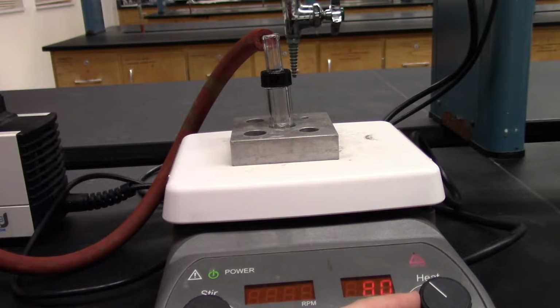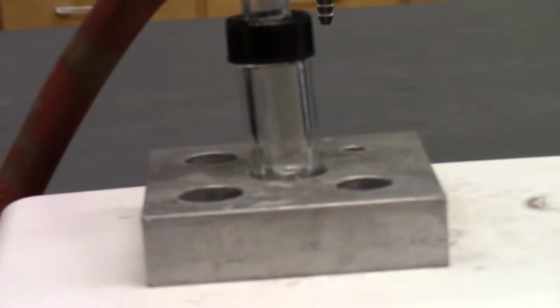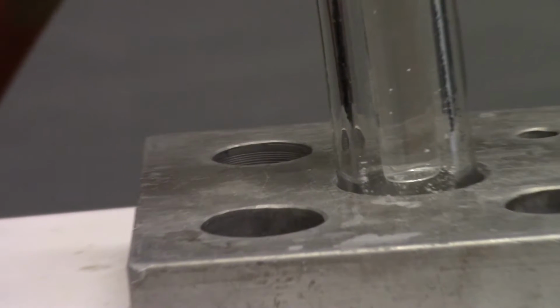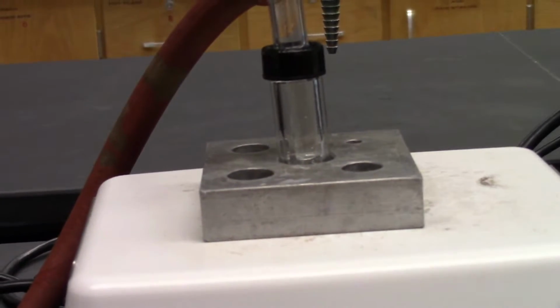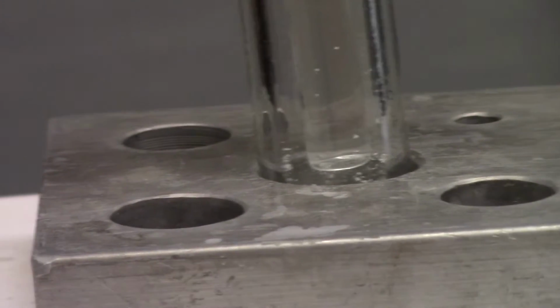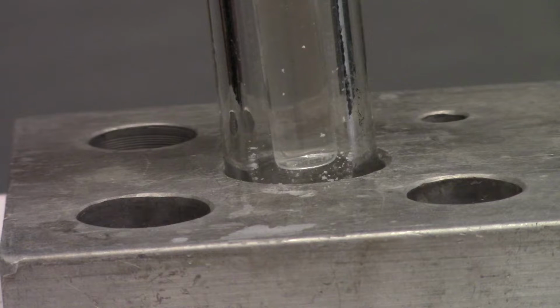I'll give it a little more juice, and I'm going to zoom in on the cold finger. If I can get a little closer for you guys. Bridge too far. There. You can see the cold finger really well, I think. There you have it. Now I'm just going to let the camera roll, and I'm going to go do something else. All right, guys. I'll see you back here in a little bit.